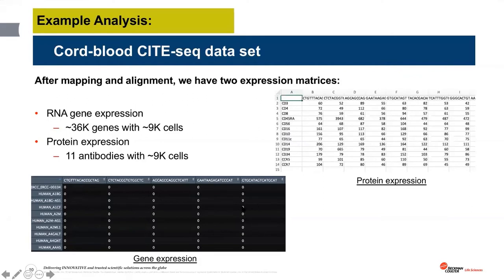And actually, this is quite common, and this is a common issue with single-cell RNA-seq data or CITE-seq data, or the RNA-seq part of the CITE-seq data. The sequencing technology allows you to simultaneously measure maybe 20,000, 30,000 different features.